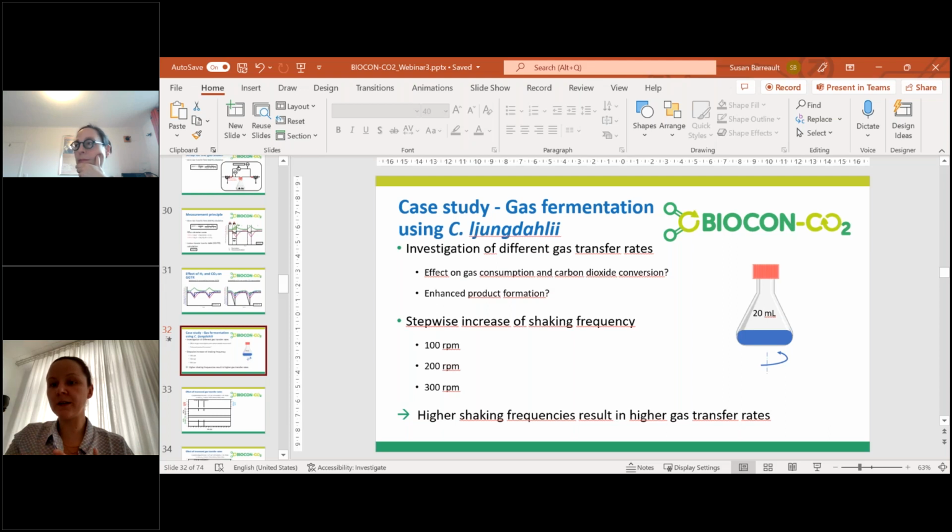We performed more tests like the one I showed you, and having a lower hydrogen concentration in the gas, so not going so high with the amount of hydrogen, enhanced the organism's ability to increase the carbon dioxide use over the carbon dioxide which is produced by the organism itself. I hope that answers it. Okay, thank you.